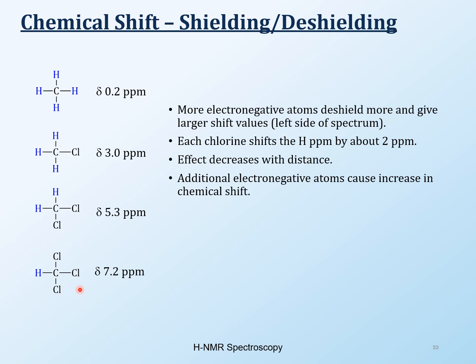This is haloalkane. This is not really alkane, sort of. This is alkyl halides. But you might think, if these protons are appearing at 0.2 or 0.5, this one should also appear. No, it doesn't, because chlorine is very electronegative.